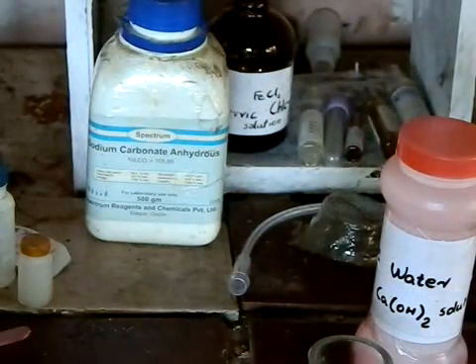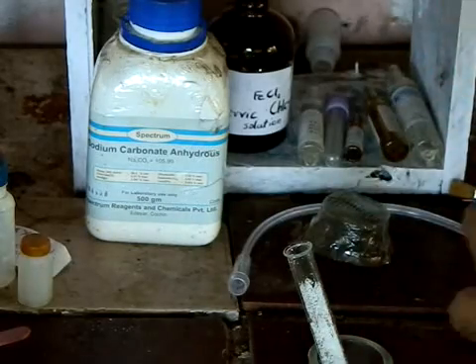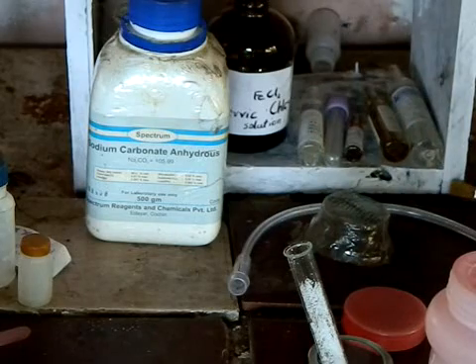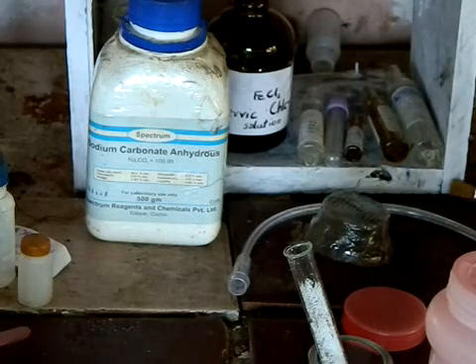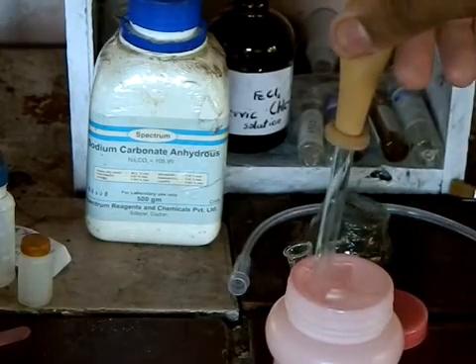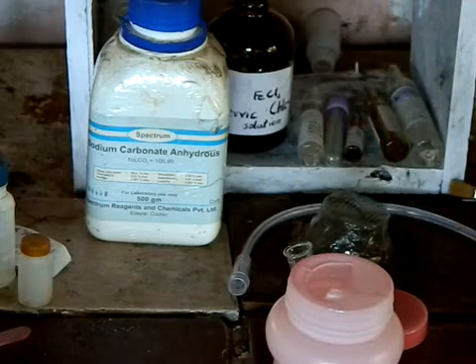Now we keep it there. Next is the lime water. Open it, and with the help of a dropper, we take out the lime water and add it into two test tubes.